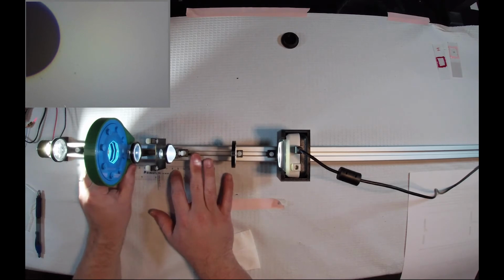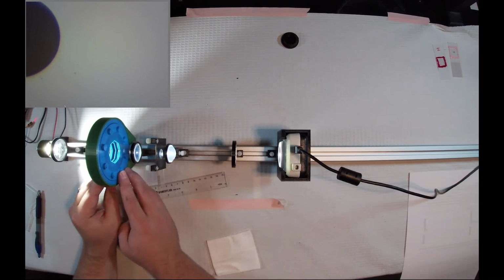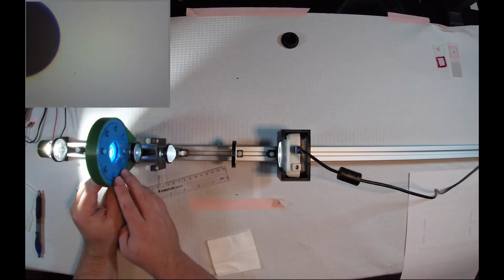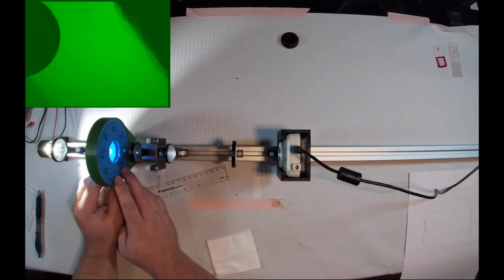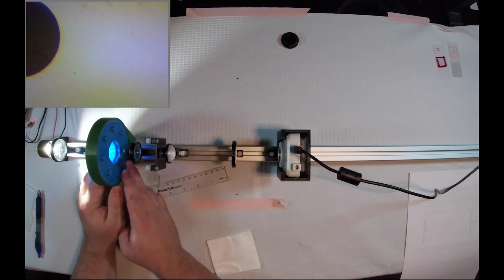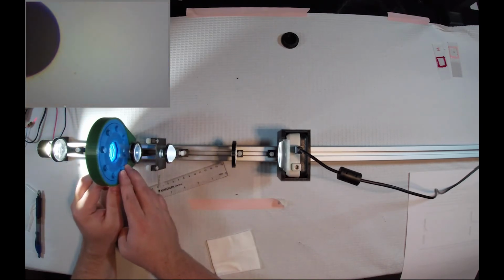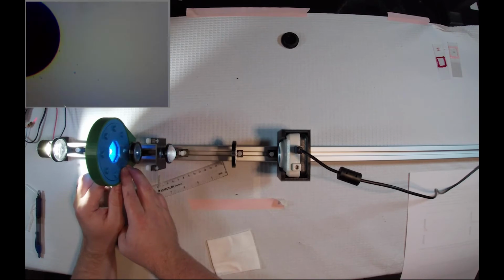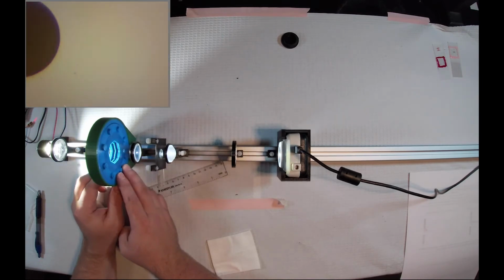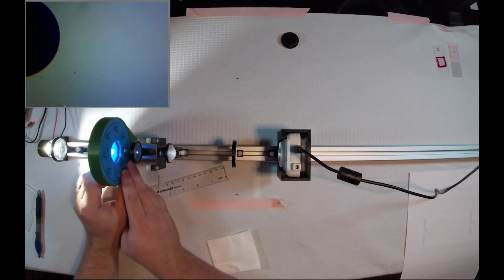A little bit closer. There. This should be reciprocal. So as I narrow down my iris, I can actually look at my sample plane, and I notice that I'm not getting sort of an image of the iris or of the teeth of the iris on the plane, on the sample itself.